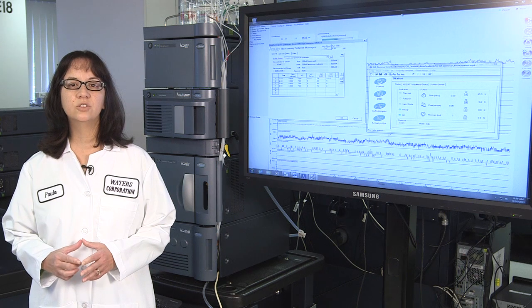So while it certainly can be valuable to use pH adjustment to develop a rugged method, chromatographers don't frequently use this approach. Part of the challenge is that preparing mobile phases of different pH is a labor-intensive and time-consuming exercise. At Waters, we have been working on ways to use our quaternary Acquity UPLC H-Class system as a tool to automatically blend buffers to control mobile phase pH.